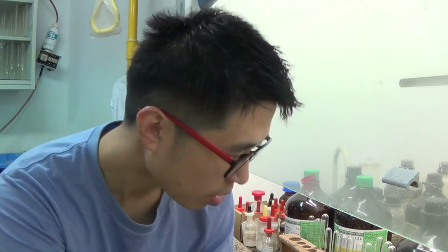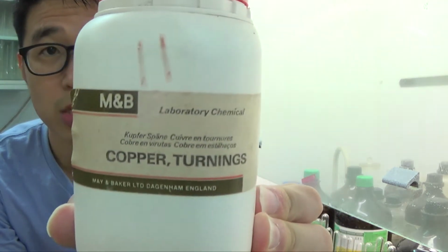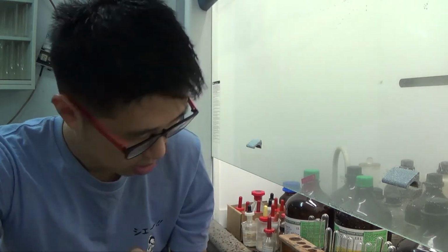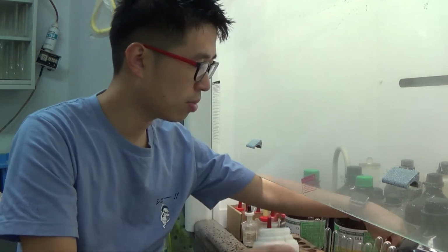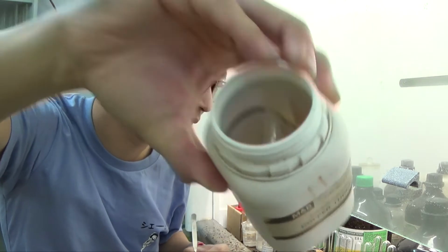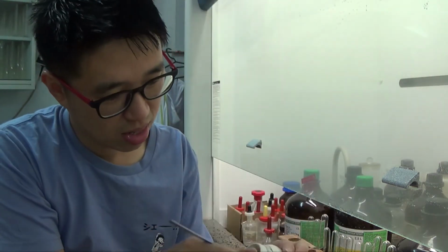Okay, I'll start off by talking a little bit about copper chemistry. So this is copper metal, these are copper turnings. Copper was used, before fiber optics came along, for your high-speed internet access. We used copper wire. I don't know why there's a small bottle in here. This is terrible. So that is copper turnings. There's a small bottle inside. I'll just scrape out a little bit of copper so you can see the color of copper inside a test tube.